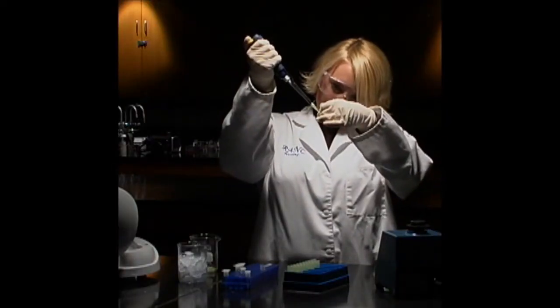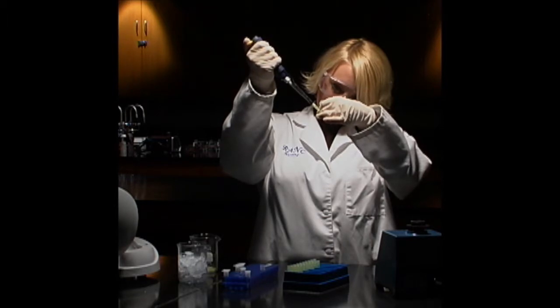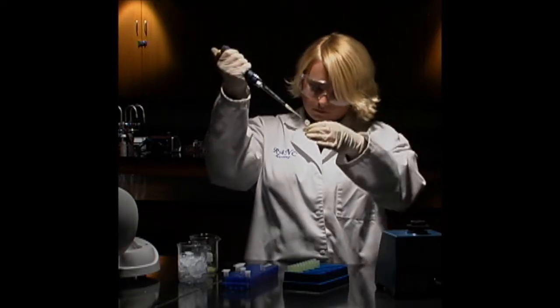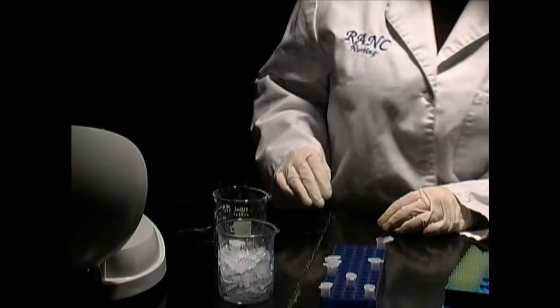Centrifuge this tube at full speed for 10 minutes to form a pellet of plasmid in the lower part of the tube. Carefully remove the supernatant with a transfer pipette without touching the sides of the tube. Leave the tube open and allow the pellet to air dry for approximately 10 minutes.